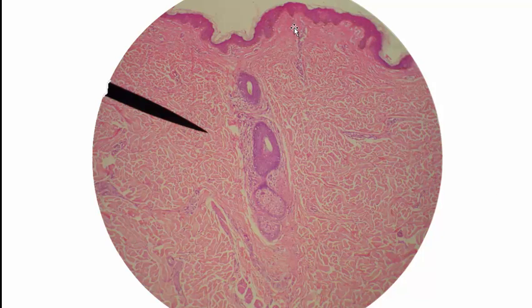And again, we can talk about the major layers here as well. Up here we see the epidermis. And we can see the stratum corneum and the stratum granulosum and the stratum spinosum and the stratum basale, but not as well as we could at the higher magnifications. Other bits of things that we can see, this structure coming through here is probably a tube for a sweat gland coming up.